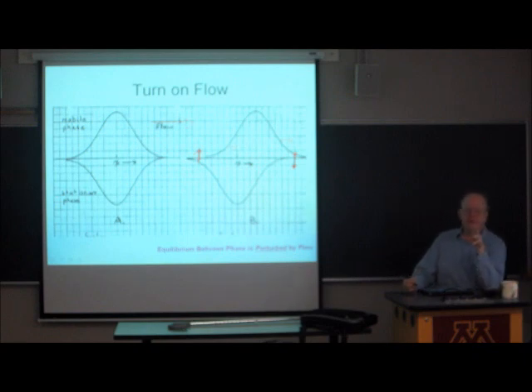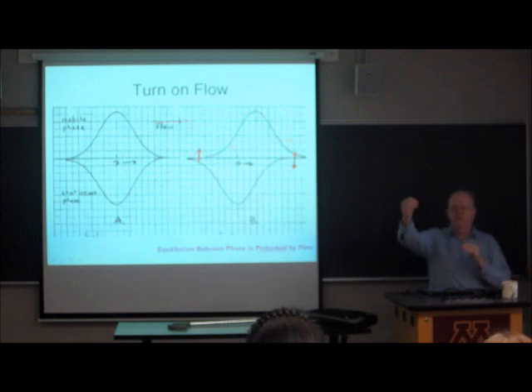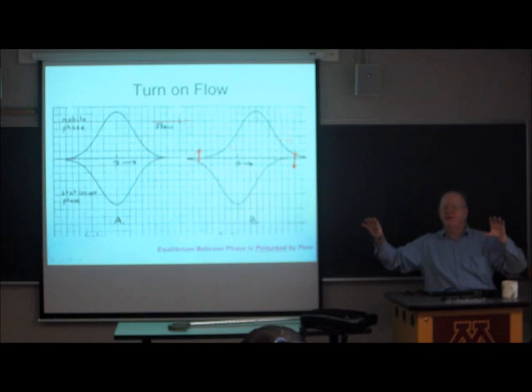The slower this process is of transfer from the mobile to the stationary and from the stationary to the mobile, the wider the peak is going to be when it finally comes to equilibrium again.